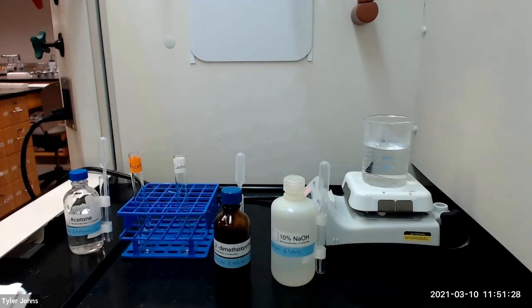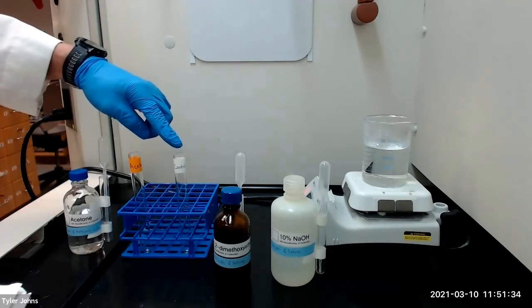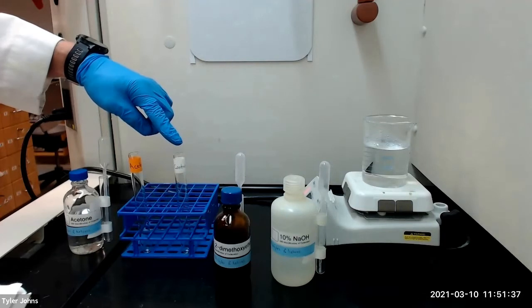We will now perform the iodoform test using acetone as our test compound. For reference, we will be using a negative control that will contain all of the reagents except for the acetone.